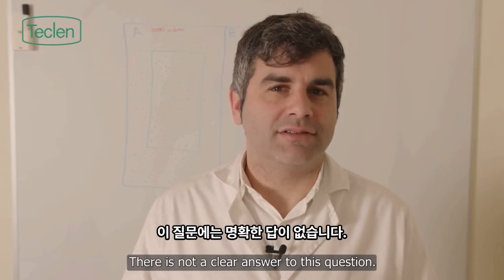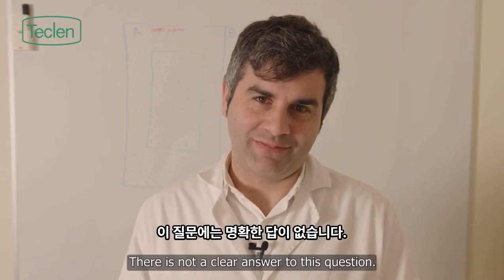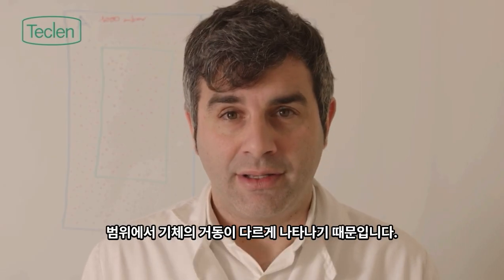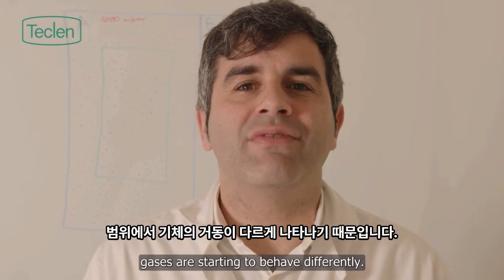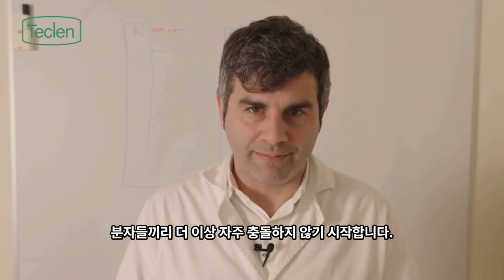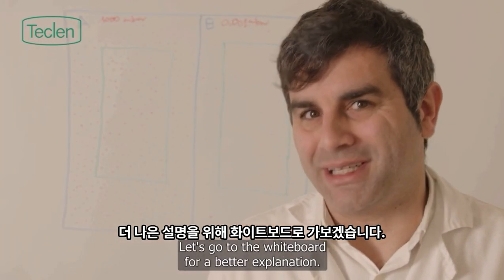There is not a clear answer to this question. And this is because at the freeze drying pressure range, gases are starting to behave differently. The molecules are not colliding between them anymore. Let's go to the whiteboard for a better explanation.